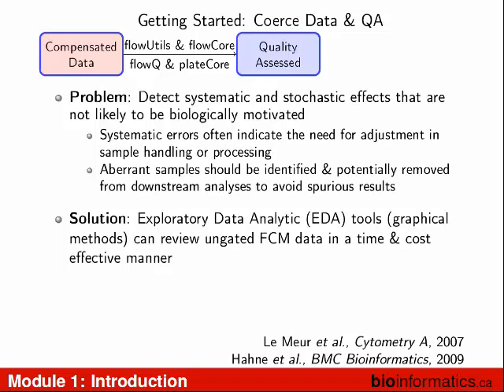But you can visualize these things using the flowCut package. So you can get this broad idea of how these samples are looking over time. You have to think, it really depends on what it is you're studying. So I can't tell you how to do that because it's experiment dependent. But you want to look at your data, explore your data in different ways, even before doing gating, to try and find things that might be different.